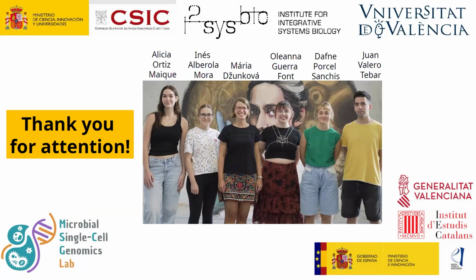Before I did this pilot experiment, I already knew that formaldehyde fixation is bad for whole genome amplification, and I knew that a better alternative is metacarn. This is a mixture of methanol and so on. Actually, methanol is used anyway in the Atrandi protocol in the beginning. So we fixed our bacterial cultures exposed to the phages with metacarn. This was actually our objective in this experiment. We wanted to make sure that when we use this fixation, because usually fixatives cause some clumps, you can maybe get doubles, actually not single cells, but two cells or several cells in one droplet. So actually, it did not affect the performance. So I would definitely recommend metacarn.